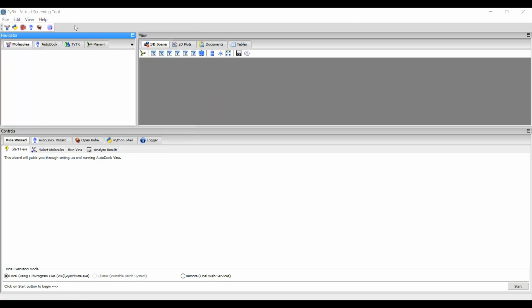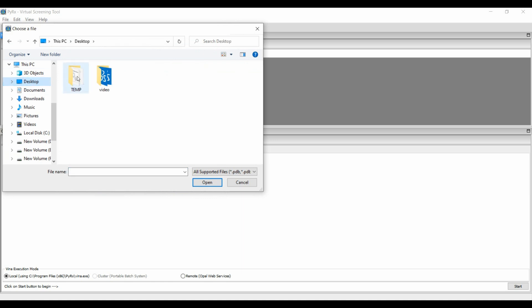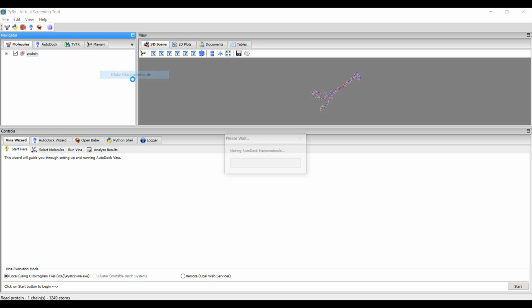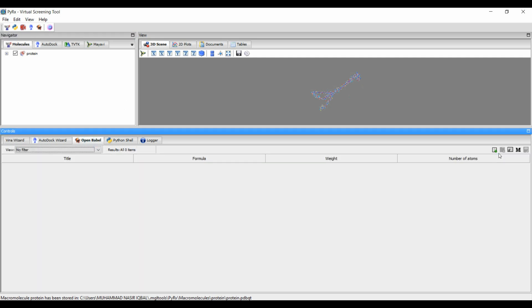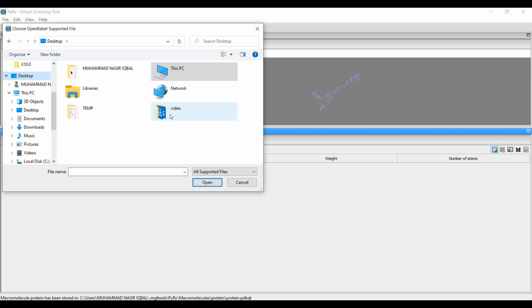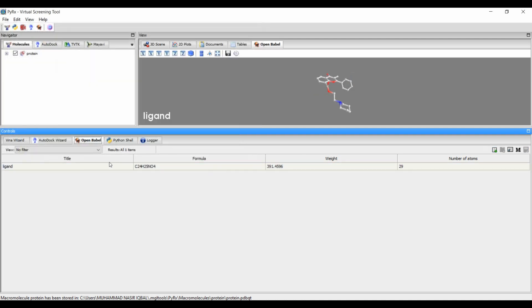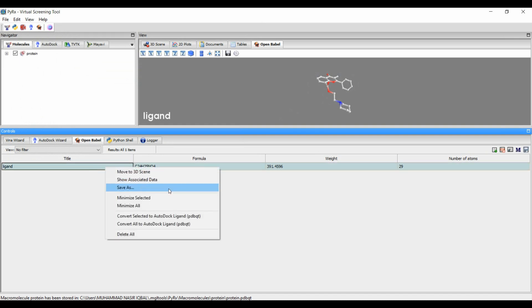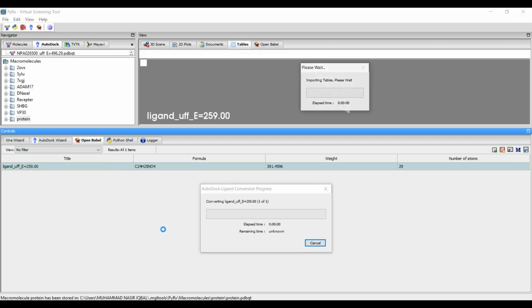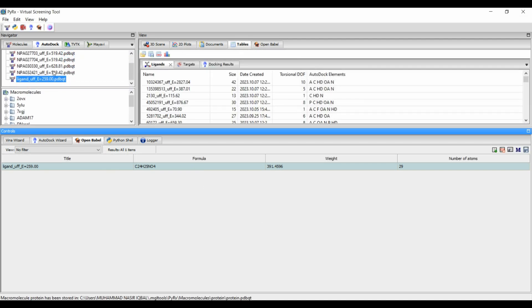In PyRx, go to File and Load Molecule and load your receptor molecule — here the receptor is the protein. Select this protein, right-click, go to AutoDock, and then make macromolecule. After that go to the Open Babel tab, load your ligand molecule, then right-click and click Minimize All, and then right-click again and click Convert All to AutoDock format.